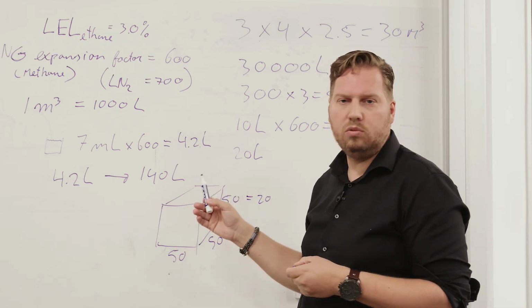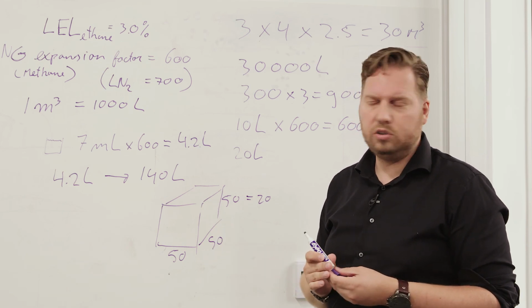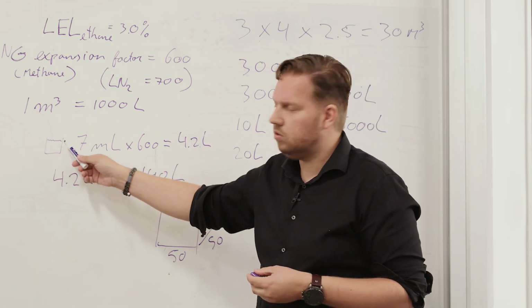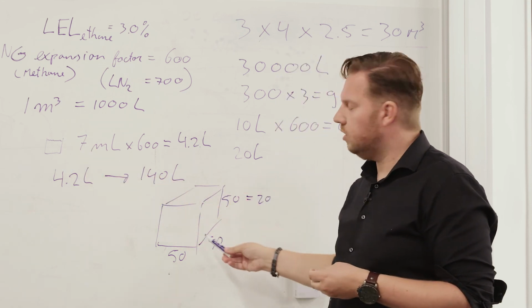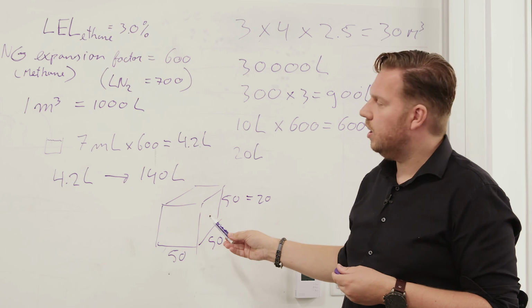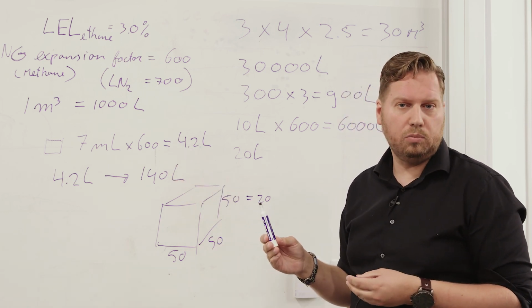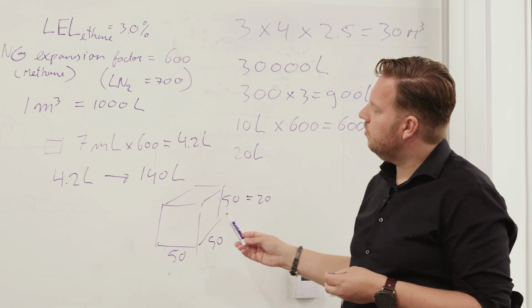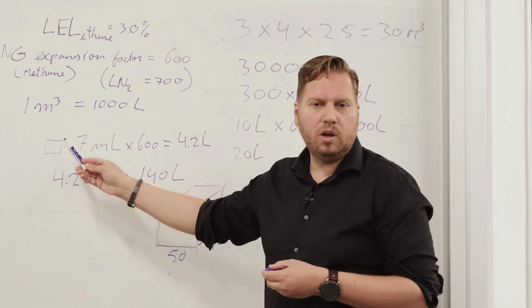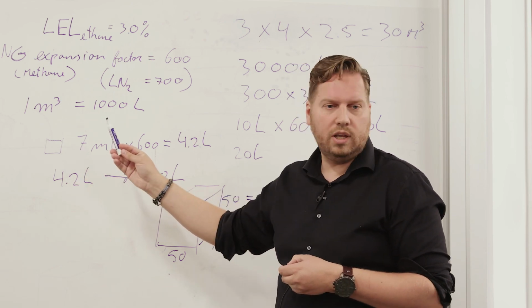Now, I've been to many labs, and there always has been a concern about the safety hazards of this liquid ethane. We now know that an explosion will not occur. However, you have to realize that liquid ethane is still highly combustible. And to demonstrate what would happen if you ignite this amount of liquid ethane, we have recorded a video that shows that.